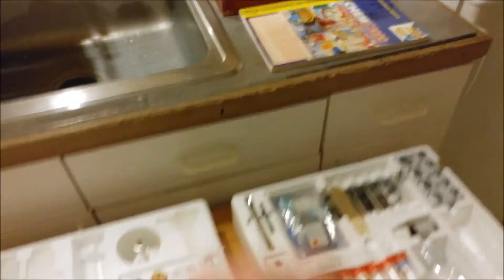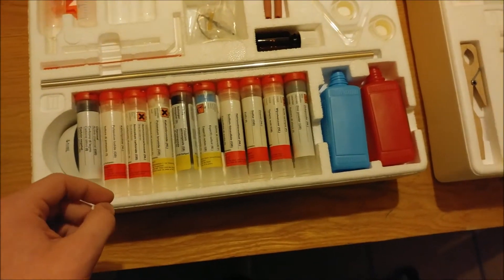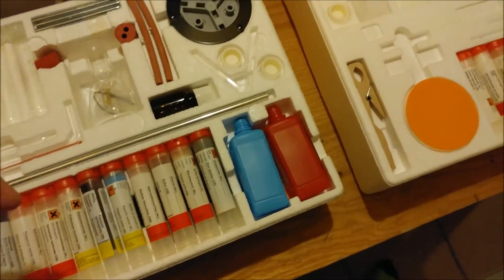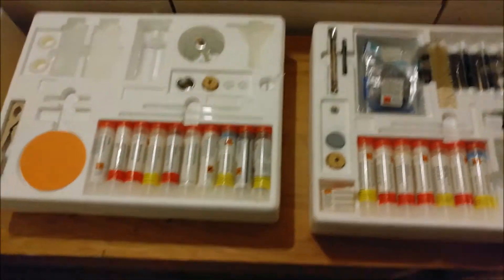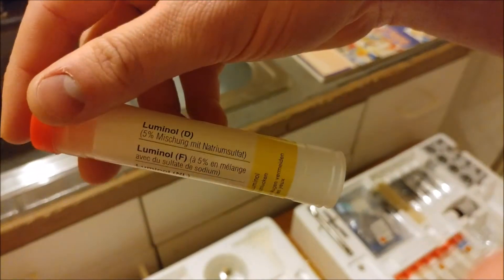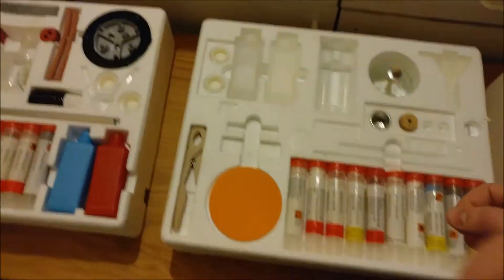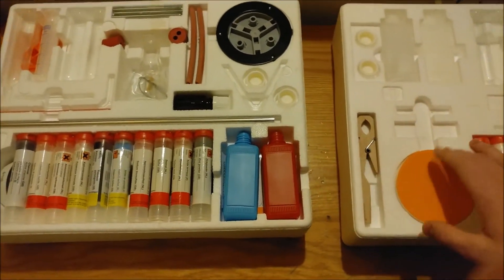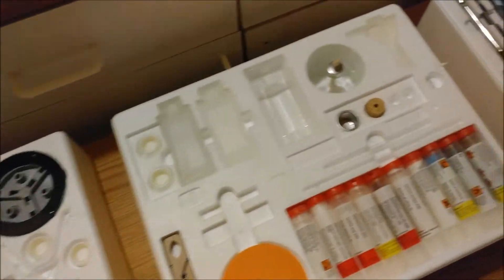There's a lot of really cool stuff in here. I'll go over some examples of experiments in later videos and show you the ones I find more interesting. If you're really interested, check the description for the chemical list and tell me if there's anything you think I can do interesting experiments with. I know there's luminol in here, and with luminol you can make experiments relating to glow sticks and such — I think that might be interesting. NerdRage and Niall Red did a video on that, I believe. Niall Red, NerdRage, and Cody's Lab are the big chemistry channels I know of.